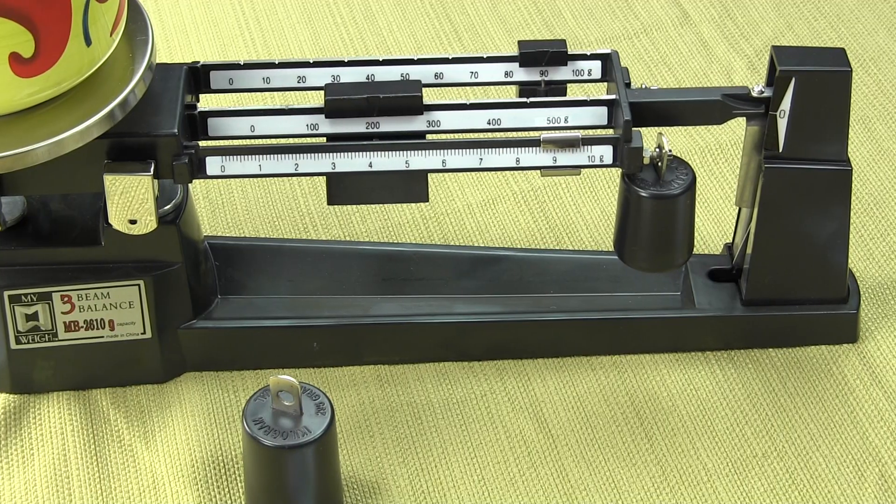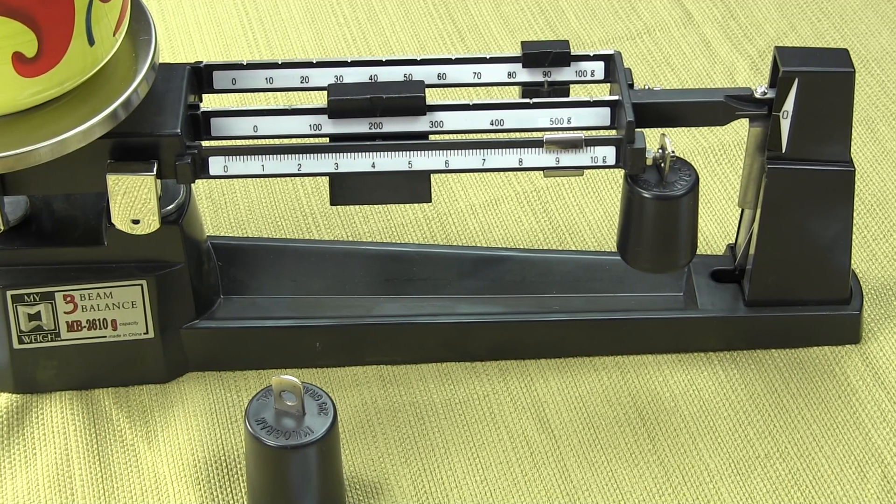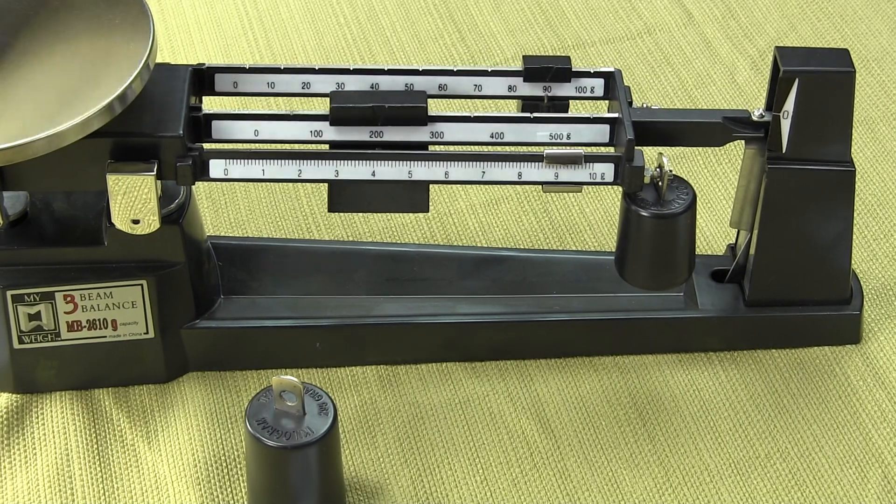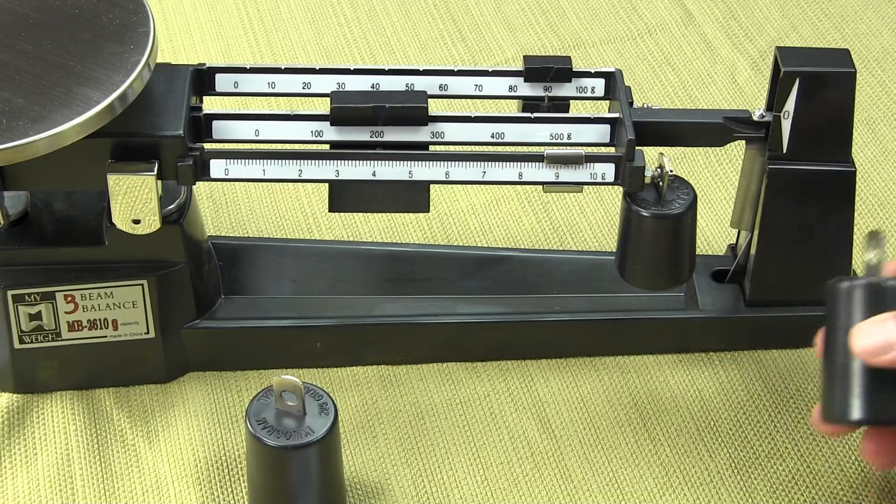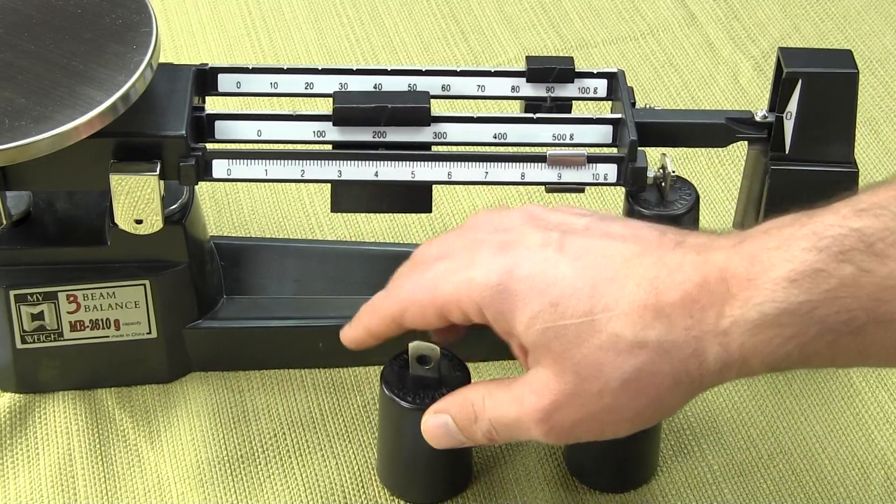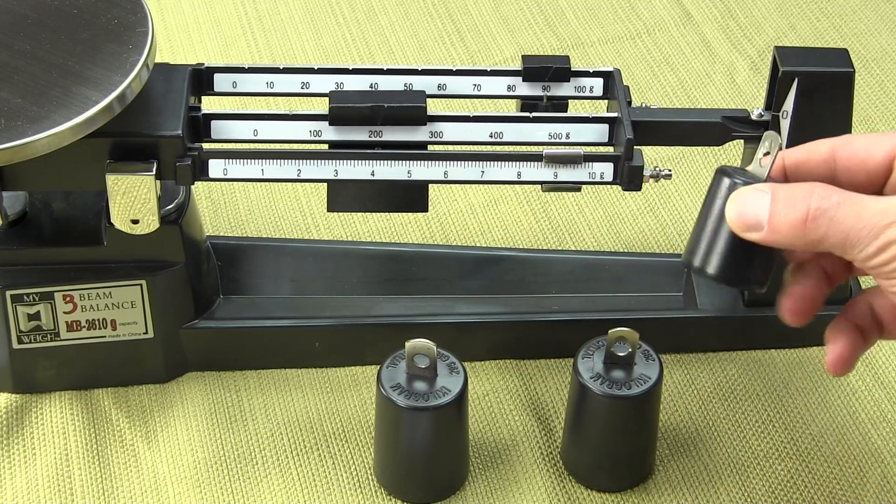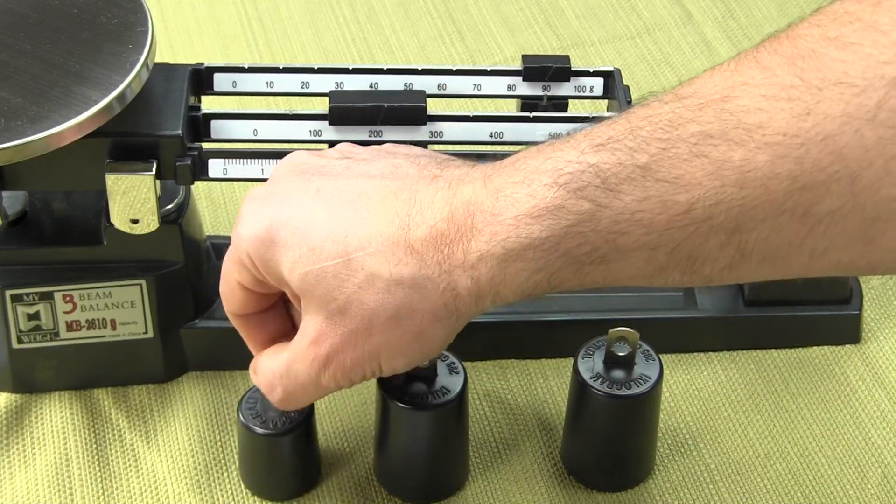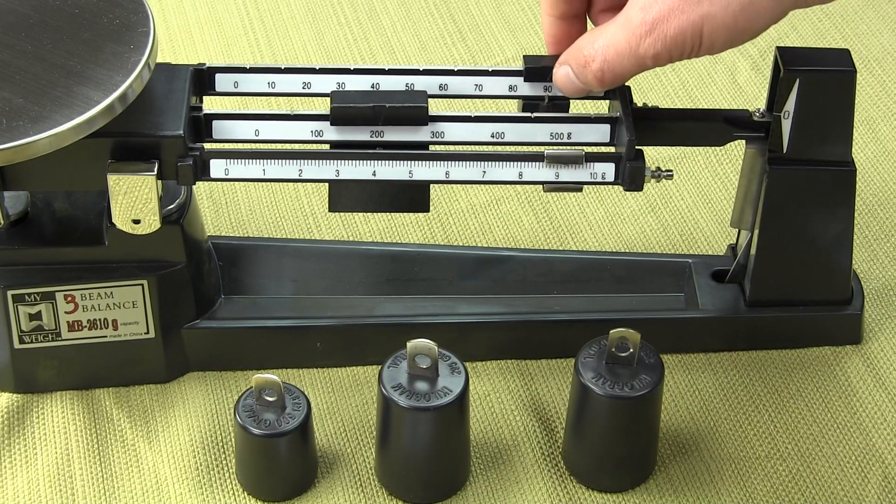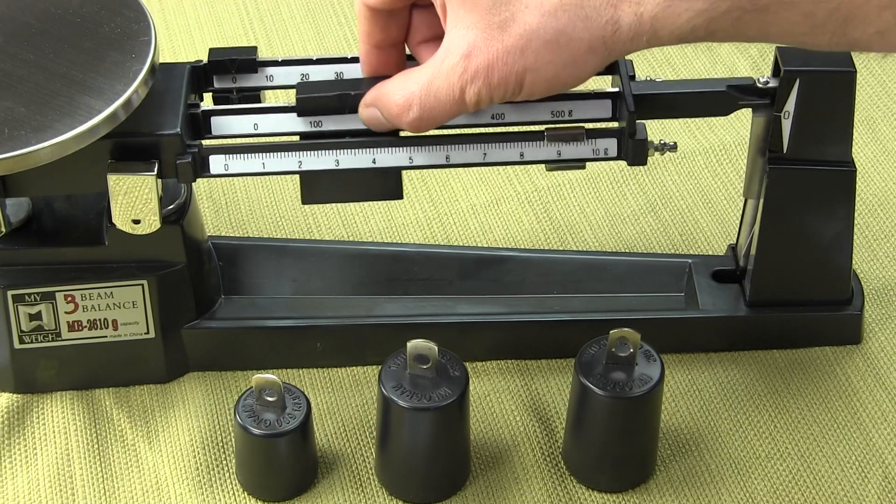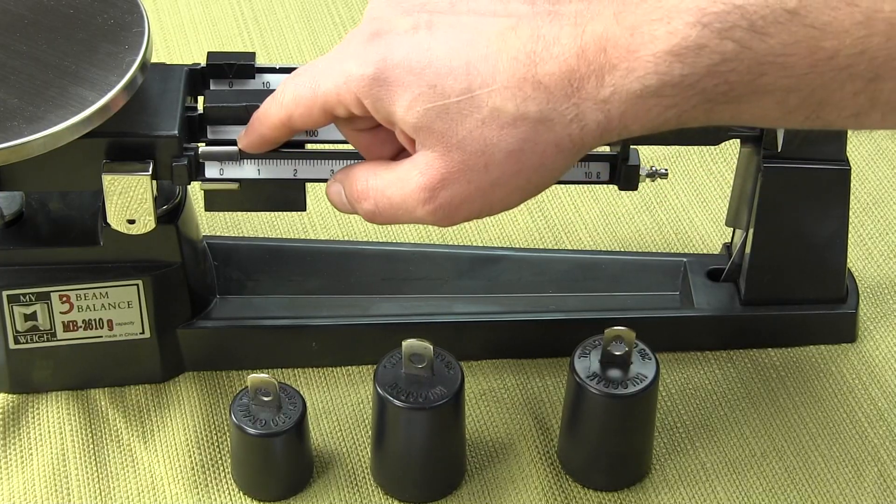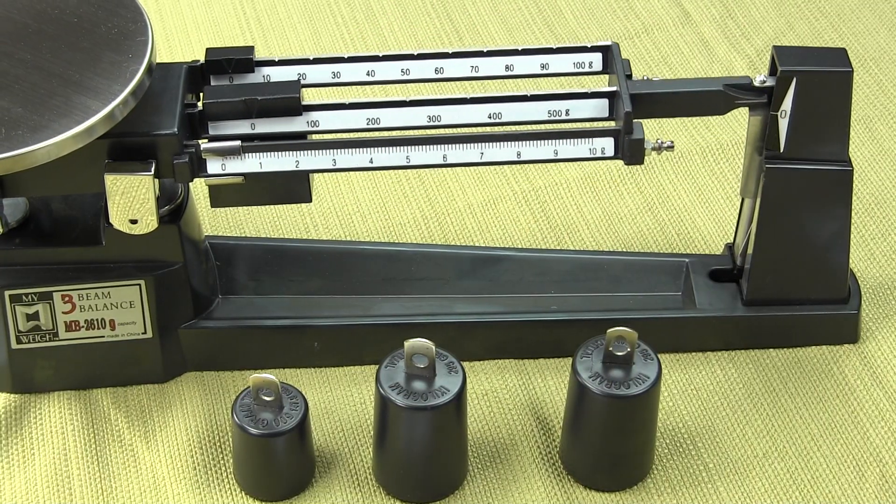When you're shopping for a three beam balance, you really want to see does the manufacturer give you the attachment weights, because these can be pricey. Some manufacturers charge $50 to $60 to $70 for attachment weights. With MyWay, they come with the three beam balance, so there's no optional accessories. Very simple operation. We see this three beam basically in the educational market to give students the idea of what is mass.